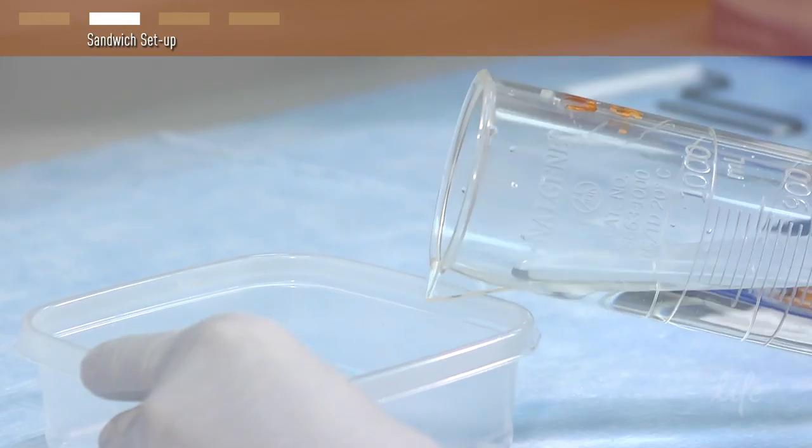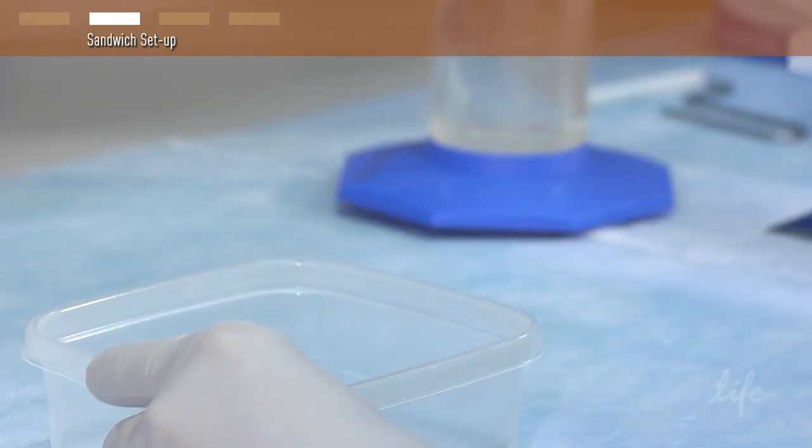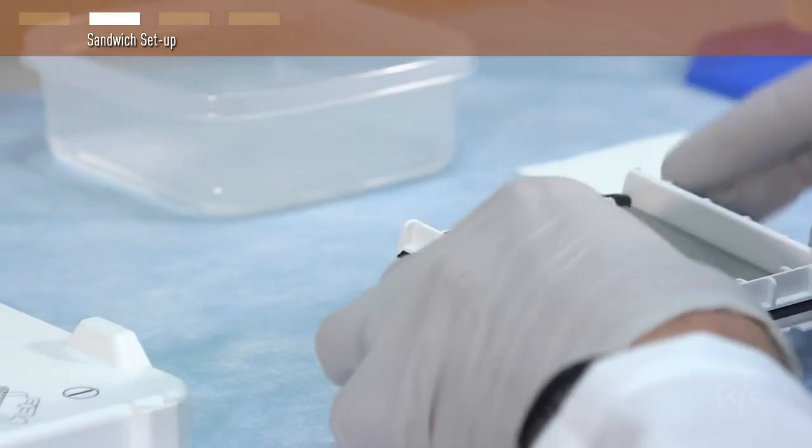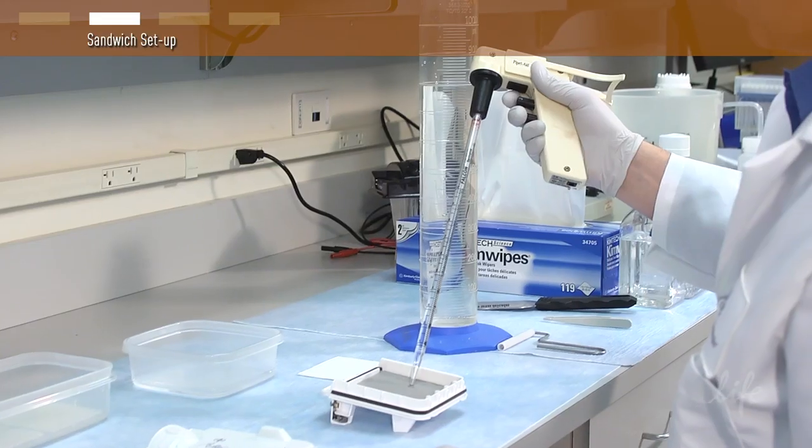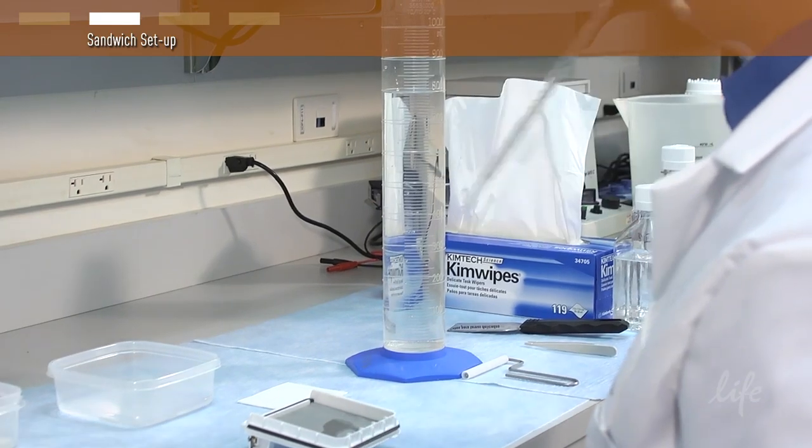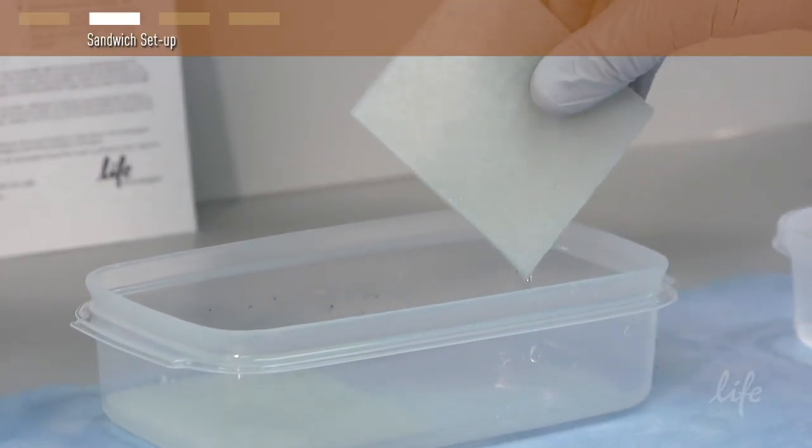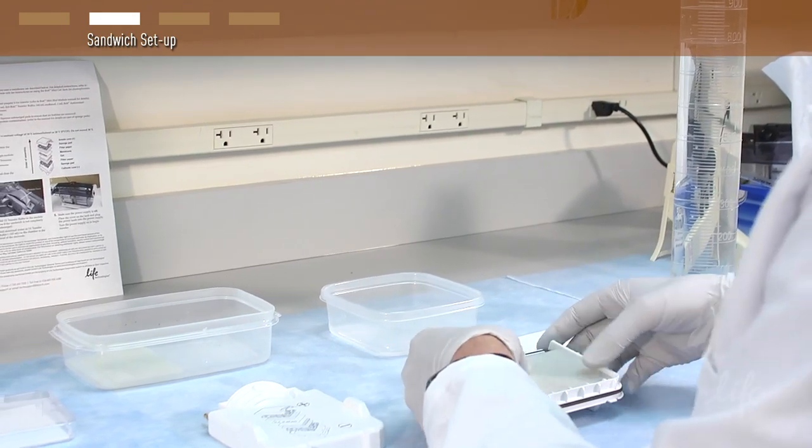Place a shallow dish on the bench and pour 1x transfer buffer to dip filter papers during sandwich assembly. Assemble the Western transfer sandwich by placing the cathode or negative core on a flat surface. Pour 5 milliliters of 1x transfer buffer into the core. Then place a pre-soaked sponge pad on the cathode core followed by a pre-wetted filter paper.